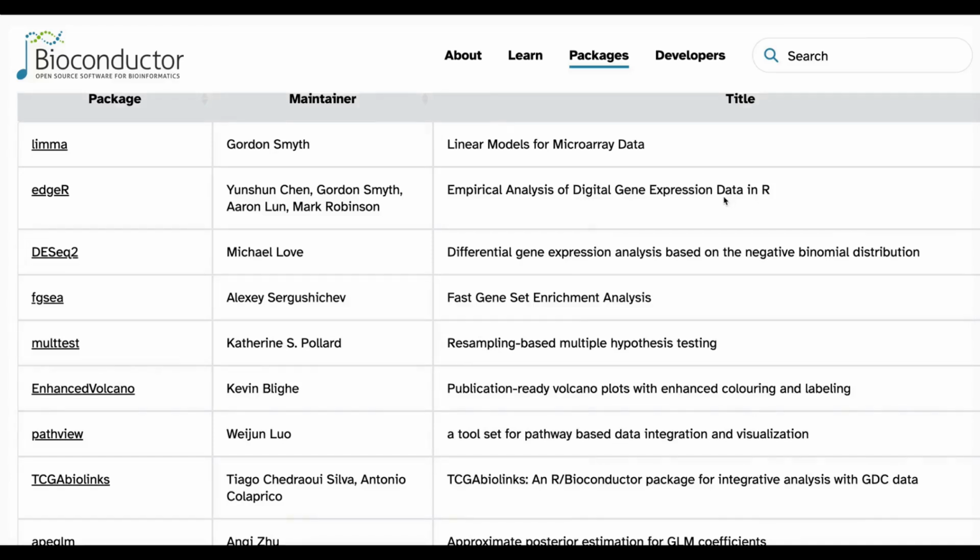Hi. The strength of the packages, what you see in Bioconductor, for instance, Limma, edgeR, DESeq, is not only in what those packages can do, but also in their compatibility and availability of other packages which would work together with any of those.